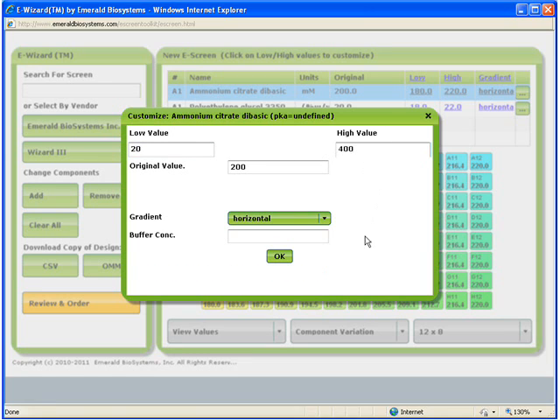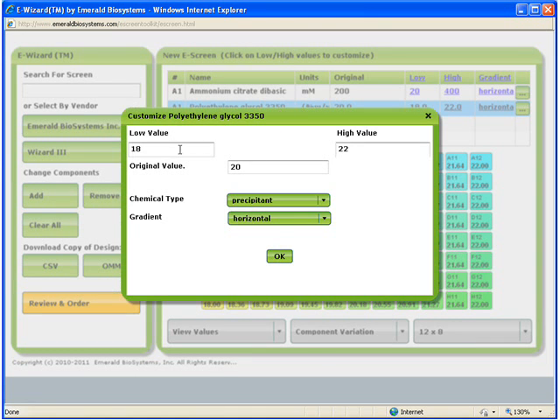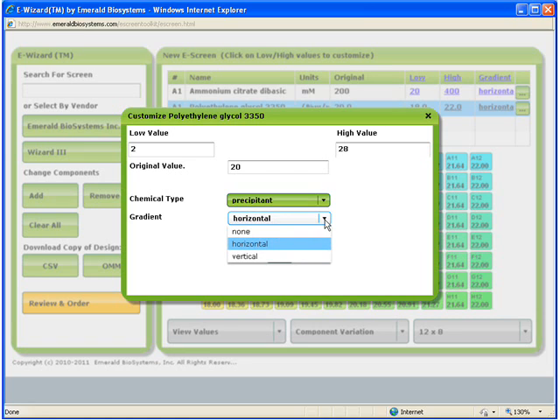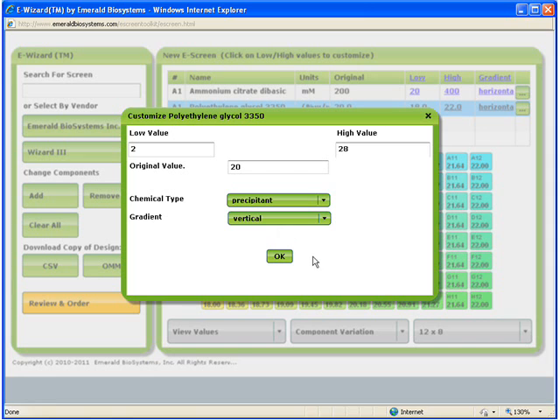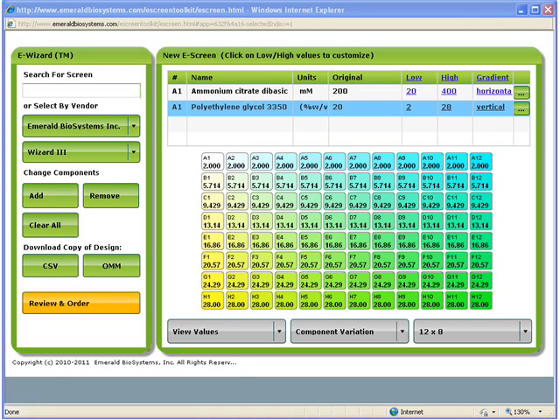Next, I will double-click on the PEG3350 and edit the gradient so that it goes from 2 to 28% throughout the screen. But instead of a horizontal variance, I will change this to vertical variance so that each of my 96 conditions are different. Now we see that the PEG3350 concentration is varied vertically on the screen. Before accepting this design and creating the screen with the OptiMatrixMaker, I would like to point out some of the other features of eScreenBuilder that allow you to truly customize your design.